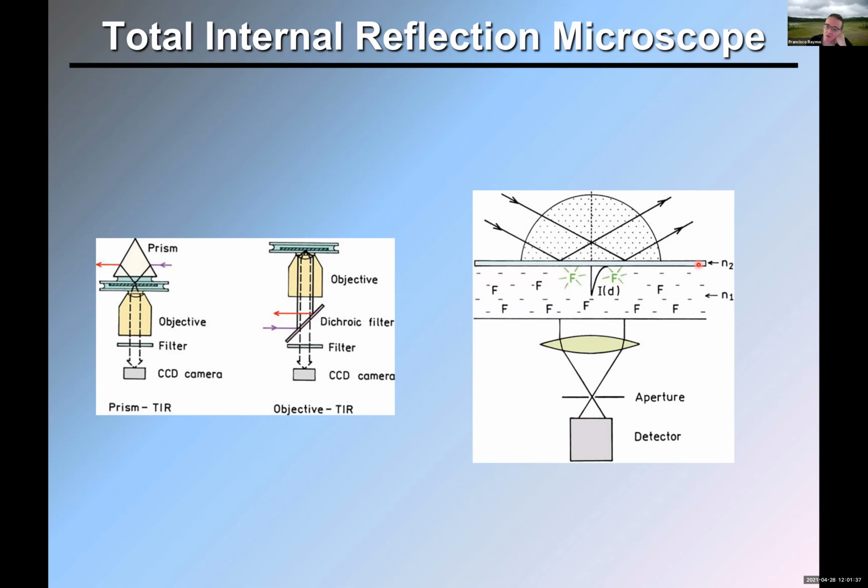And then on top of the solution, you have a glass slide over here. And then the laser exciting the molecules is somewhere up here at an angle relative to the surface. And the angle has to be so large that the incoming light is totally internally reflected. So the light doesn't go through glass, it bounces off, okay? So it remains on the same side of the sample.